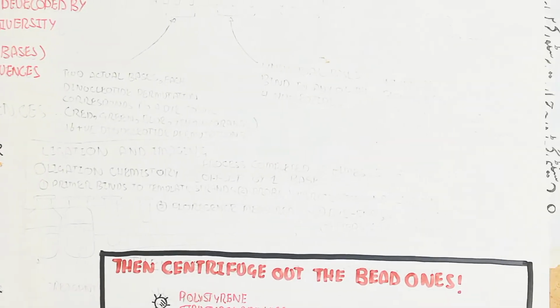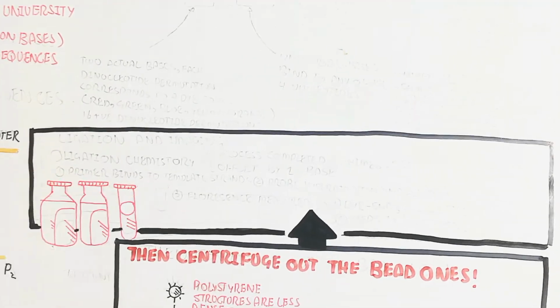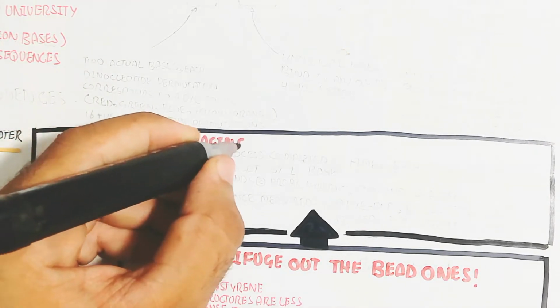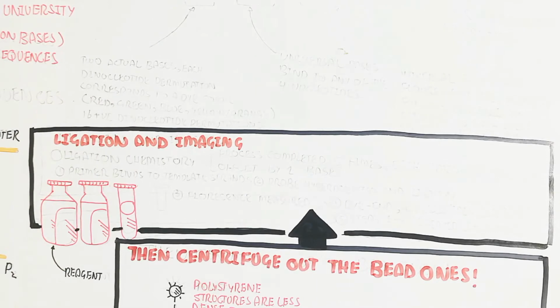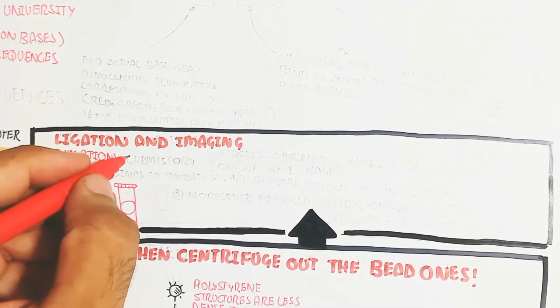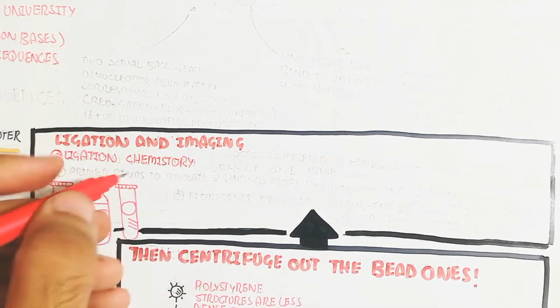So remember, I am repeating that the polystyrene bead is very important for the P2 adapter binding to the segment of the DNA, while the PCR bead is not bound to a large bead due to the P1 adapter. Remember, the P1 adapter will bind with the PCR bead.